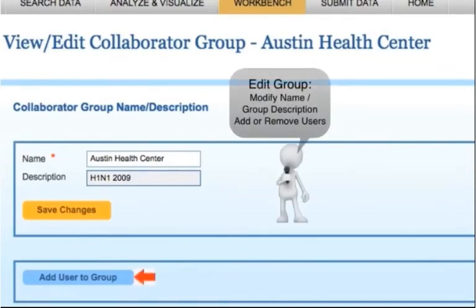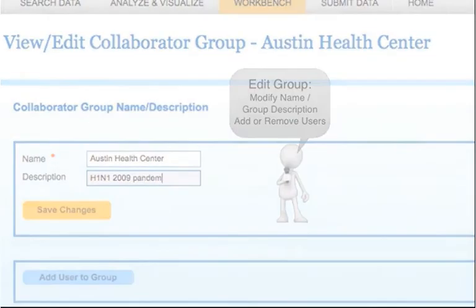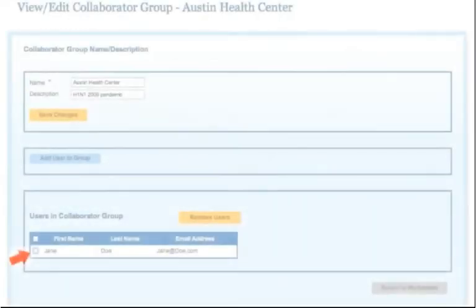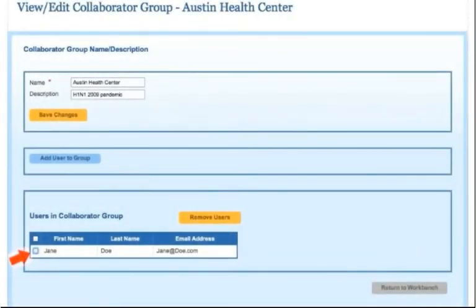Add users to the group by clicking the Add User to Group button, or remove users from the group by checking the box next to one or more users' names and clicking the Remove Users button.